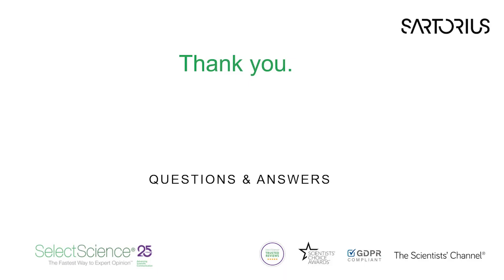The first question we've got here for you, Kate, is an attendee saying that when they are pipetting some liquids, sometimes they notice that, one, due to capillarity, a little bit of liquid flows inside the 10 microliter tips before they start pipetting, and that may impact accuracy and precision. How can we solve this problem? And two, sometimes right after they remove the pipette from the liquid, it moves up and it seems like they're missing a few microliters. Could you provide any insight on why this happens?